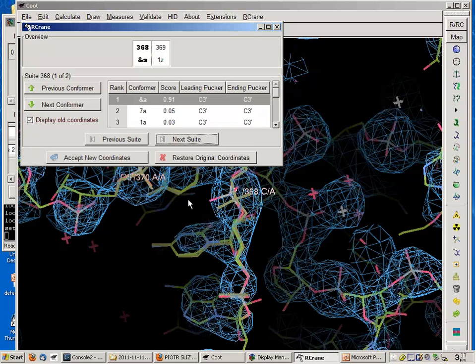You can also use it to search for motifs. So there's certain signatures within the eta theta plot that you can use to find motifs. So there's a handful of features in there. Yeah, and it should be available on SBGrid. So I think if you just type in Amigos 2 from an SBGrid command line, you should get that up and running, and then you can load in crystal structures and do searches. Okay. Any other questions from the audience?